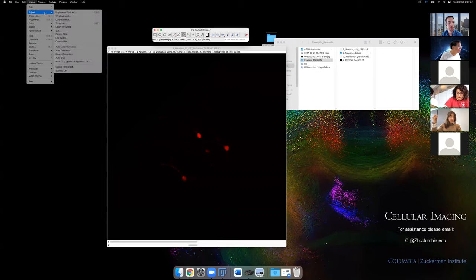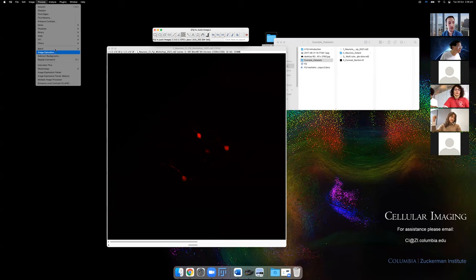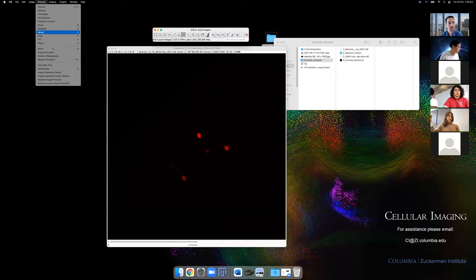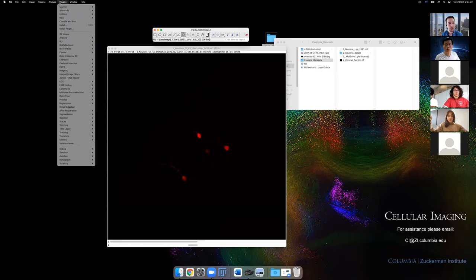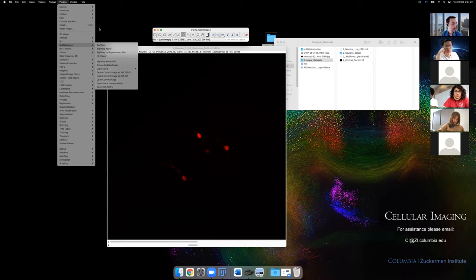There are adjustments for things in the image, a lot of stack tools, and processing tools — sometimes much faster than doing things in Imaris. Fiji comes with a lot of plugins included, and there's a huge community working on tools for ImageJ. Next week we'll go into more advanced tools and it's very easy to add them and combine them for a nice image analysis pipeline.